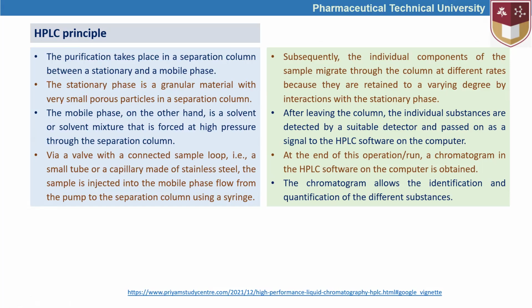The optimization of the condition requires identifying the solvent which can be effectively used to separate the compounds with similar structures. So the mobile phase and its components, and if they are a mixture, the ratio of solvents are very significant in order to achieve higher efficacy of HPLC utilization.